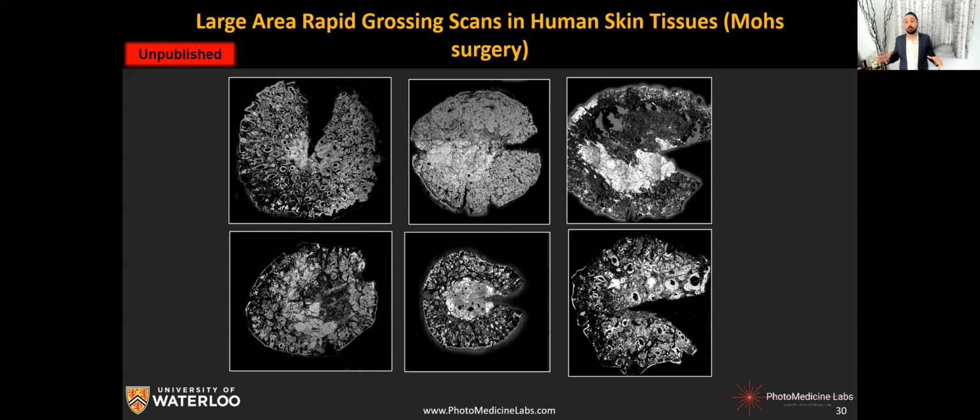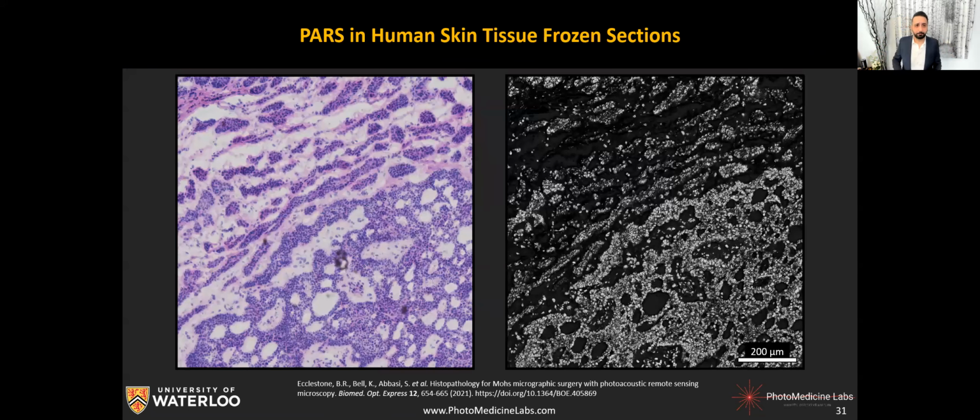And the idea is to do it as fast as possible. For some of these images, we can now do it in around 10 to 20 minutes, depending on the resolution. But with some advancement, we can take this to less than 10 minutes, or even down to a few minutes. So again, these are all skin cancer images.